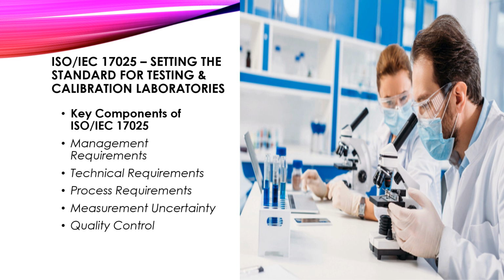Now, some of the key components of ISO/IEC 17025 include, first, management requirements. Laboratories must establish and maintain a quality management system to ensure the effectiveness and efficiency of their operations. And this involves defining organizational roles, responsibilities, procedures, and policies to uphold quality standards. Resource requirements, or technical requirements. Adequate resources including personnel, facilities, equipment, and materials must be available to support laboratory activities. Competent staff, properly maintained equipment, and suitable testing environments are essential for accurate and reliable results.